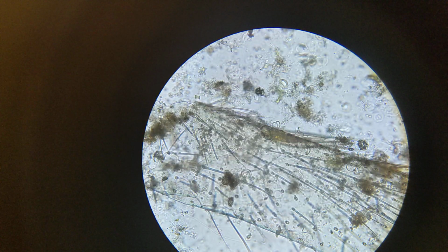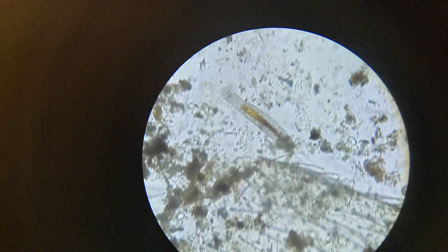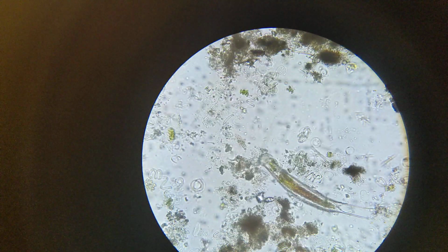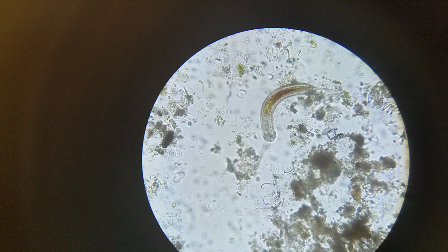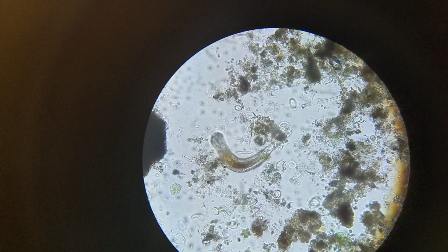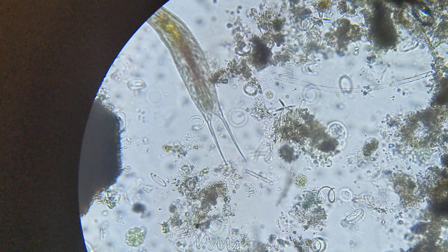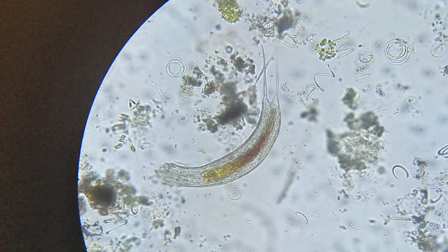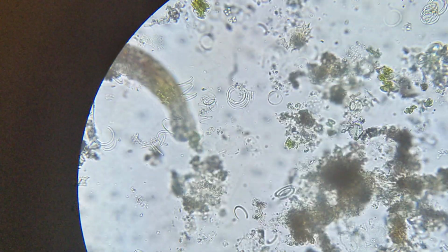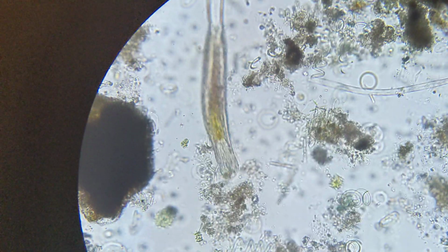No, gastrotrich. Or it might be, it's not a flatworm. It might be some sort of a roundworm. And yet it seems like it's got cilia on its front. So I am not sure what that is. I can bump my phone magnification up to a little under 2. Yeah, this is looking pretty good. I suspect it's not a gastrotrich, and that it's some sort of a worm instead.